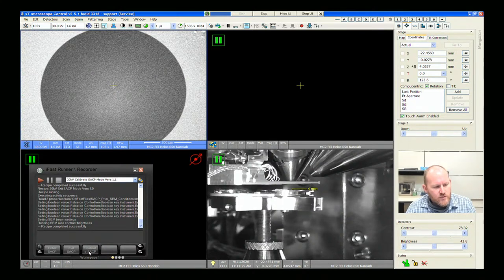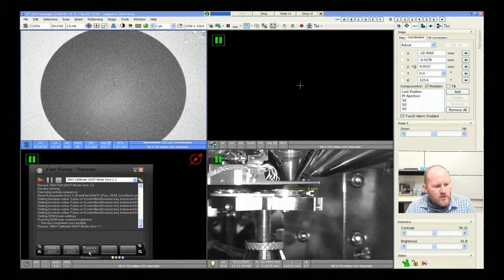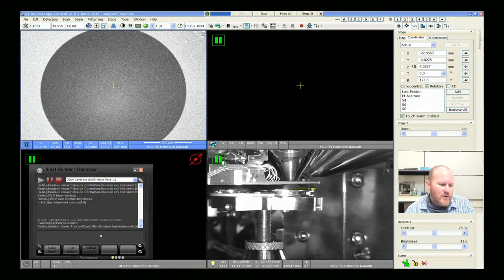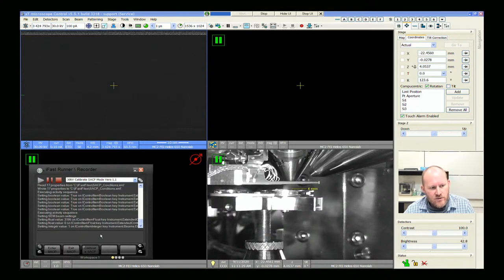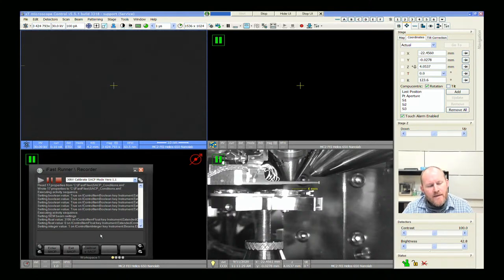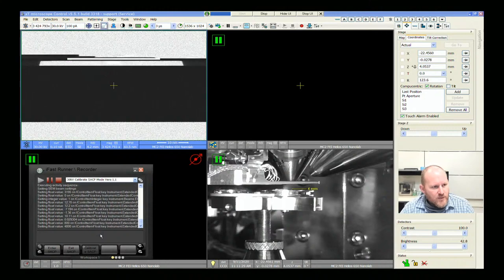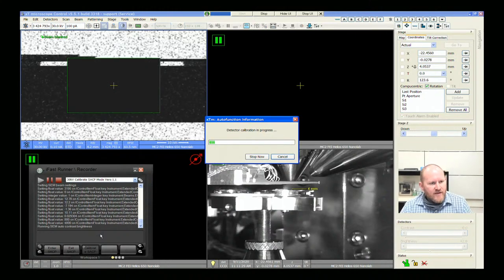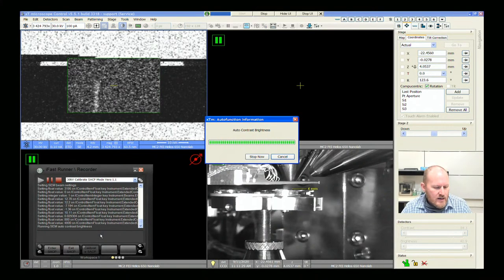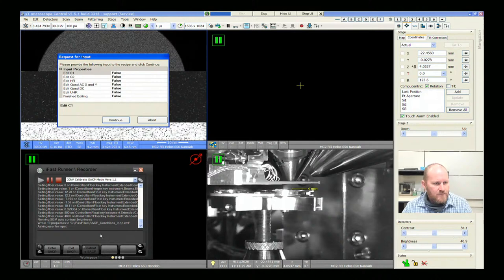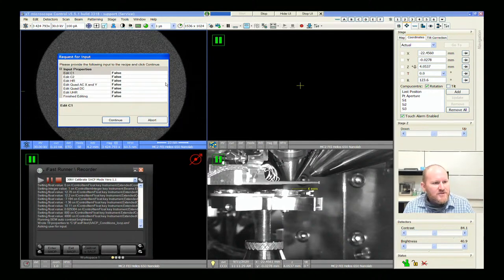The first step when we use our scripts to create these SACPs is we have to run this calibration. As long as you're in the ballpark it's pretty close and you can use the iFast script. Anyone who's built scripts with iFast or run iFast regularly will know that it is not as responsive as you might like — this would be a million times better with a Python API.